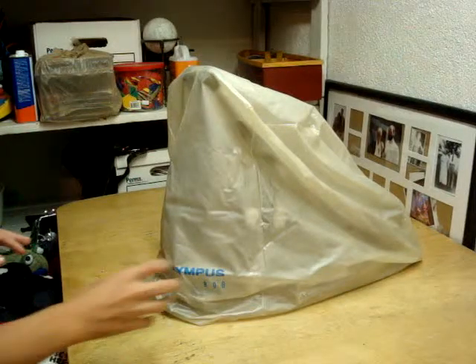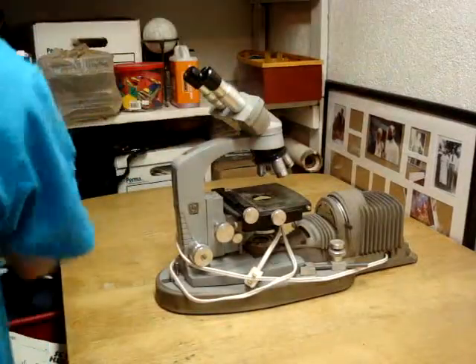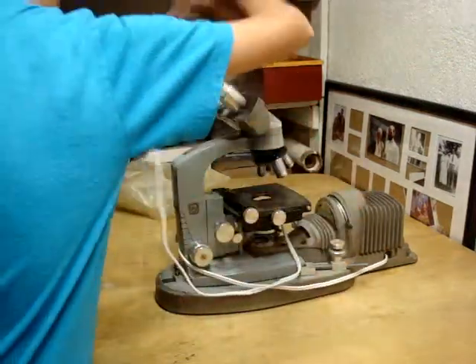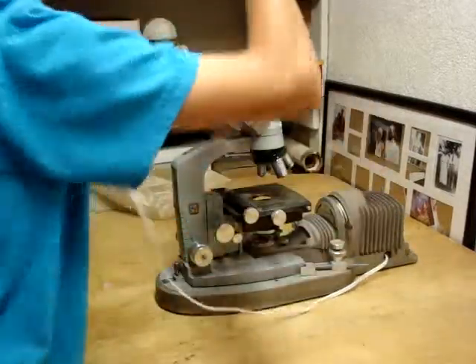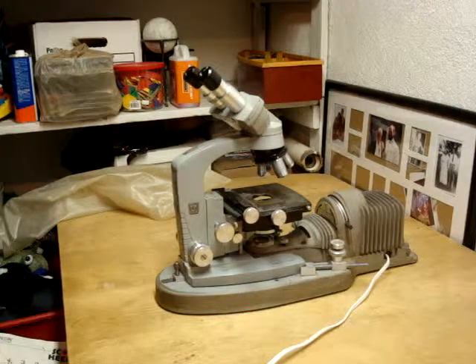When you first get a microscope it should look like this — it's got a cover on it. You can pull off the cover and the cord should be wrapped loosely around the microscope just like this. Once you have it unwrapped, you can plug it in.